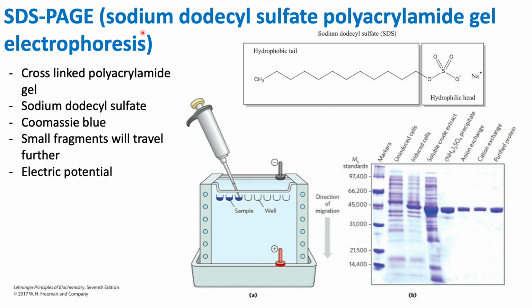So SDS PAGE is based on molecular weight, where sodium dodecyl sulfate is the molecule that is carrying our proteins or fragments through the gel. And that is essentially SDS PAGE.